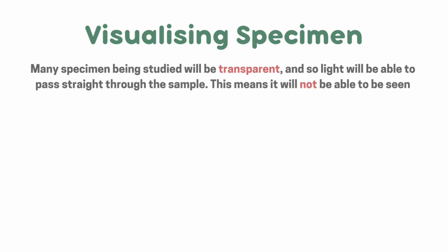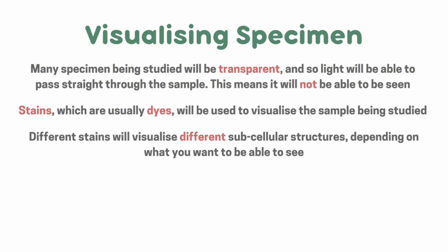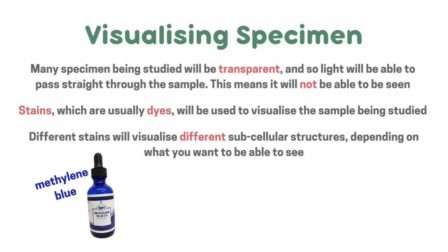Many specimens being studied will be transparent, and so light will be able to pass straight through the sample. This means it will not be able to be seen. Stains, which are usually dyes, will be used to visualize a sample being studied. Different stains will visualize different subcellular structures depending on what you want to be able to see. For example, methylene blue is a stain that's used to turn DNA and RNA in cells blue.